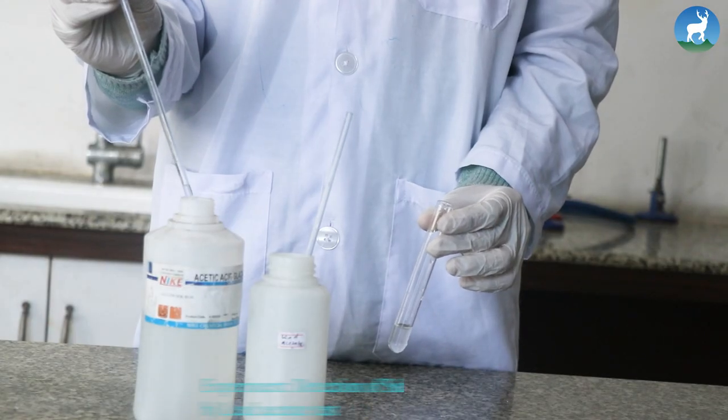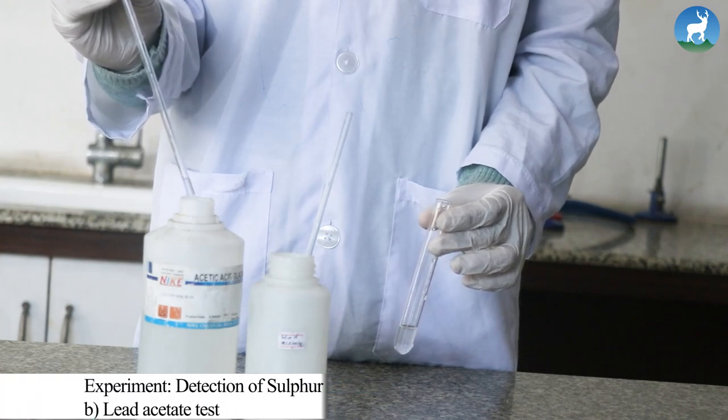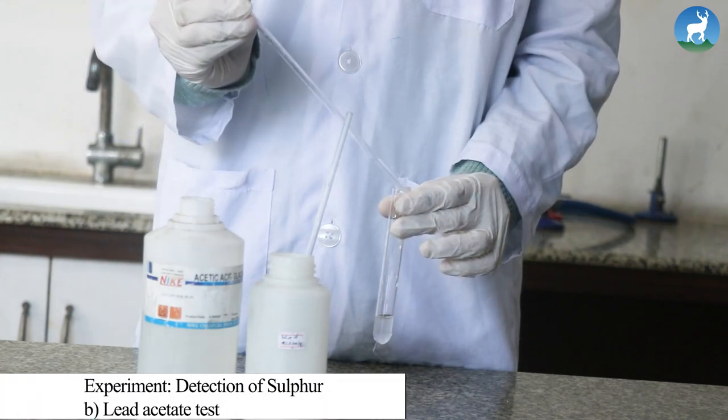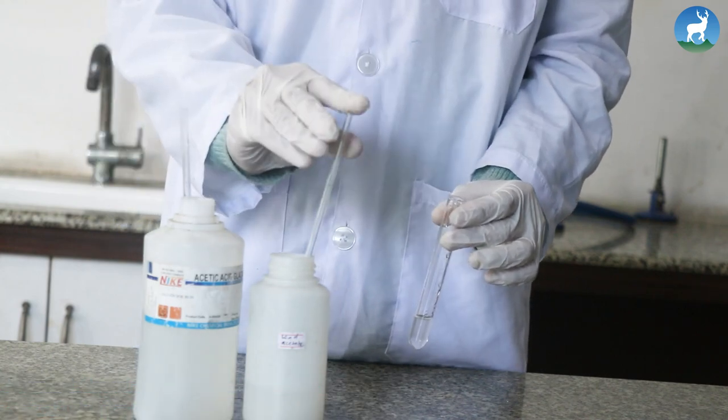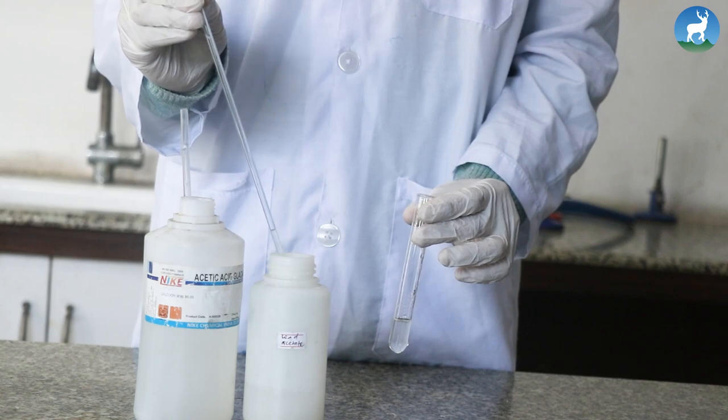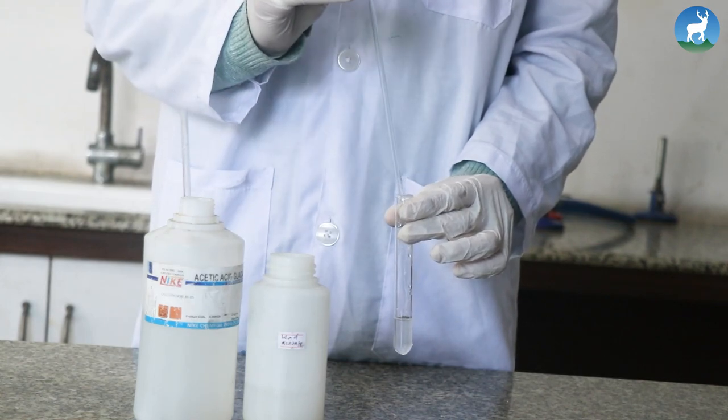The second test to detect sulfur is lead acetate test. First of all, add 1 ml of acetic acid into 1 ml of sodium extract. Then add 2 to 3 drops of lead acetate solution.